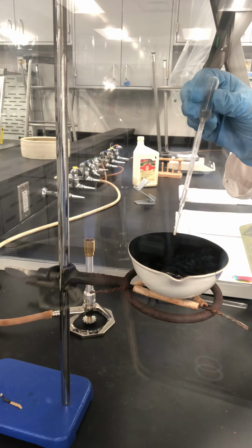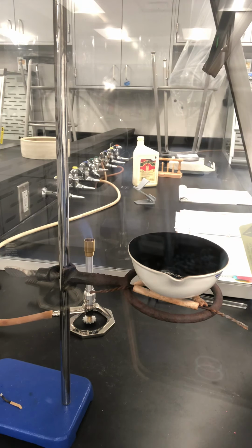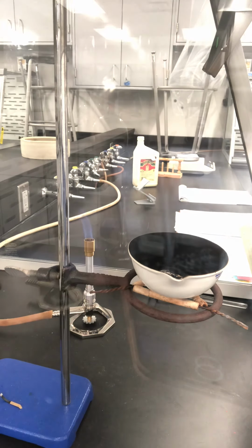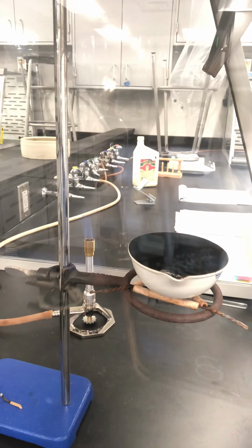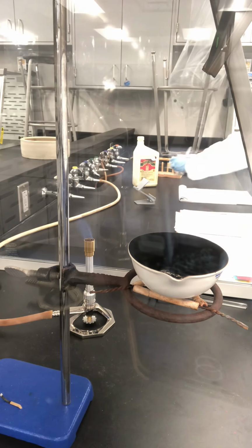One, two, three, 4, 5. Let's see, bubble. 6, 7, 8. Since I have bubbles in 2 of the drops, I will add another 2 drops. 1, 2. Okay.